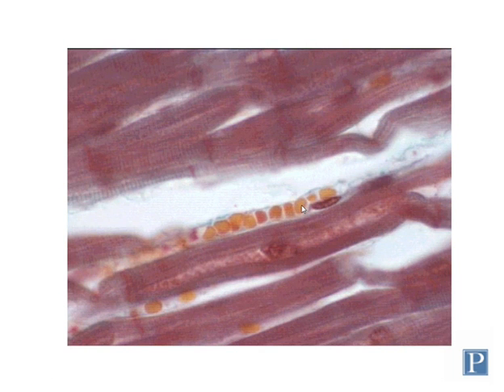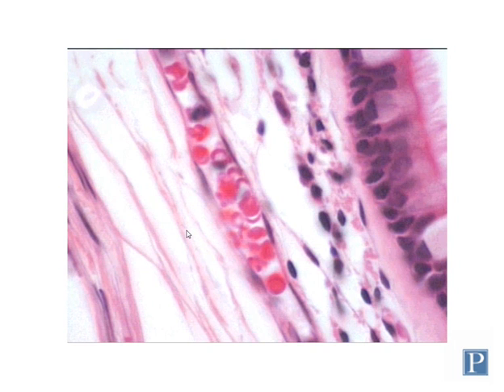This is a capillary shown in longitudinal section in cardiac muscle, and in this section you can see again the lumen of the capillary is only about as wide as the red blood cells, and so they're forced to travel single file through the capillary. Here's a slightly larger blood vessel. This is probably a post-capillary venule, and you can see maybe two at a time can pass through in this particular case.